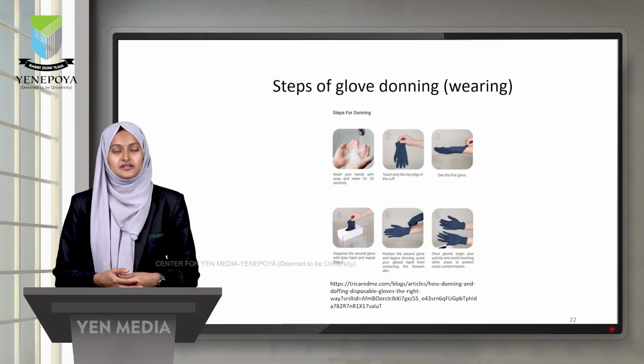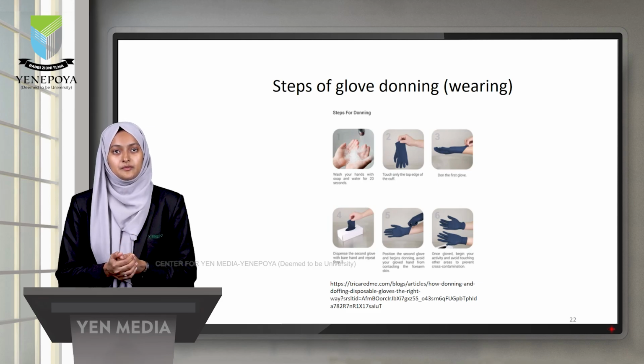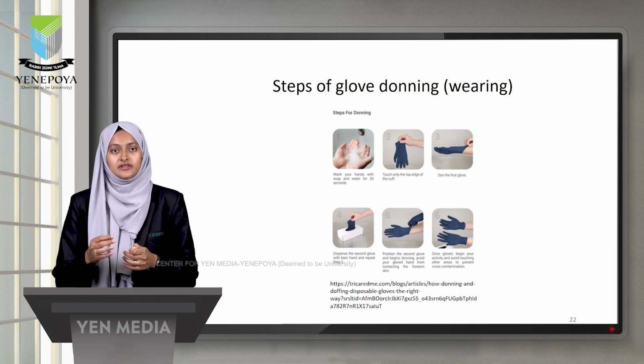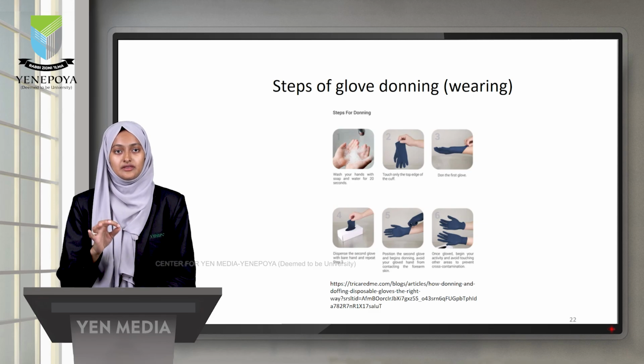Now there are steps of glove donning. Donning means wearing the glove. Whenever any personal protective equipment has to be donned, the first step is to perform hand hygiene. Then touch only the top edge of the cuff of the first glove and don it. Once you've donned the first glove, with the bare hand, not with the gloved hand, you pick up the second glove and don it as well.